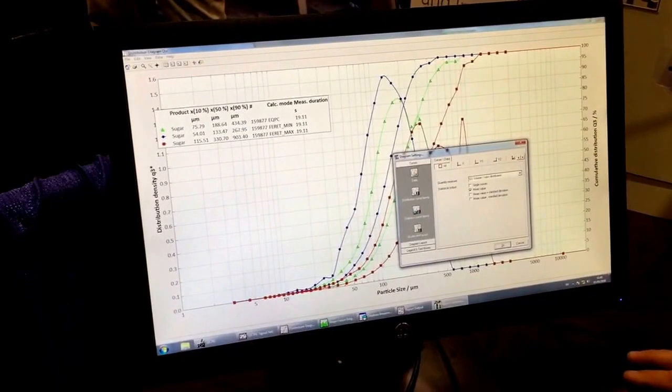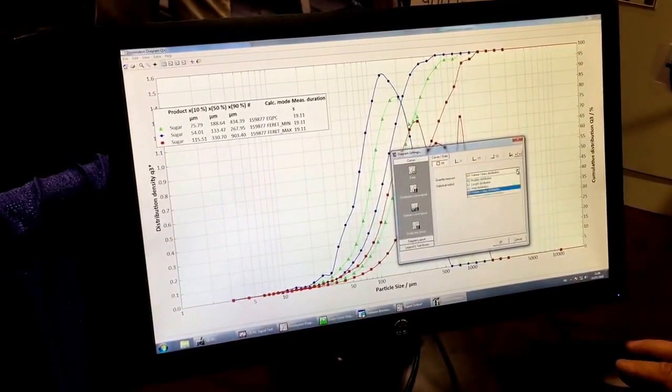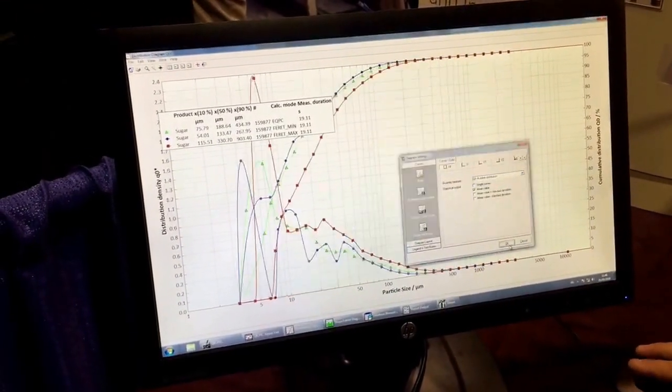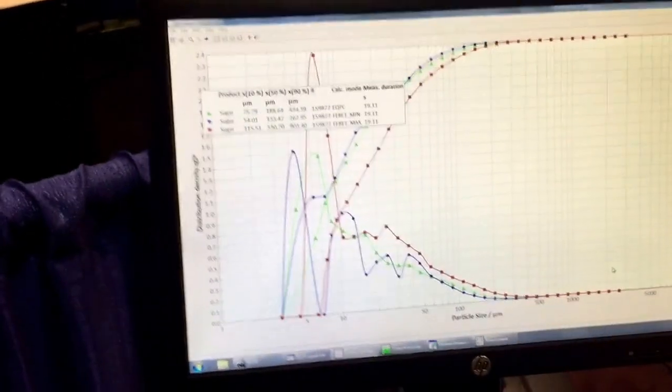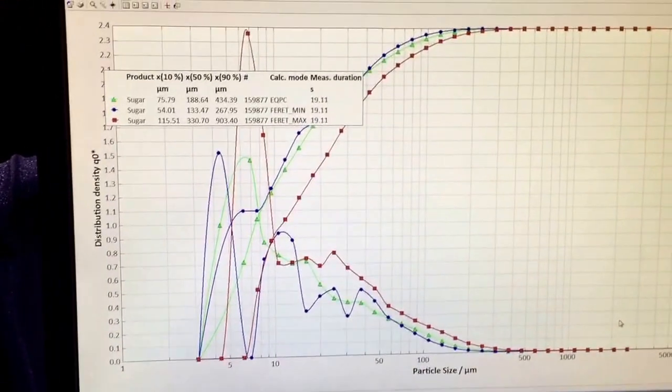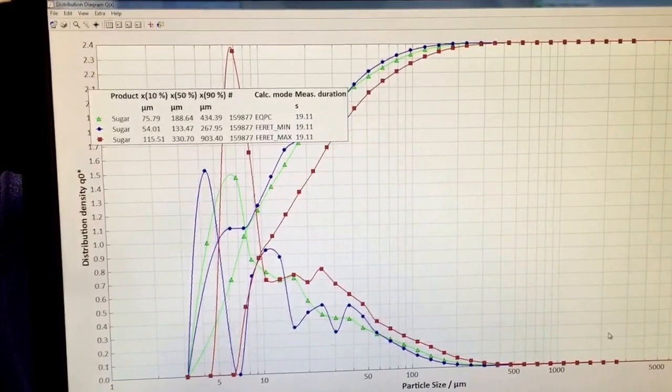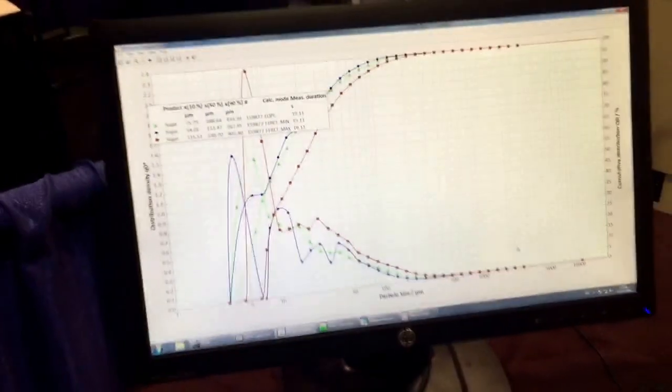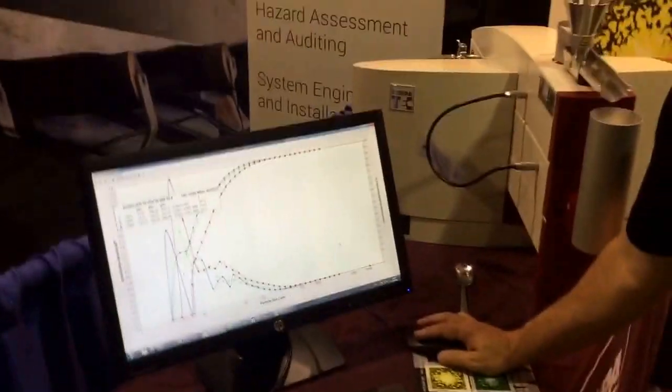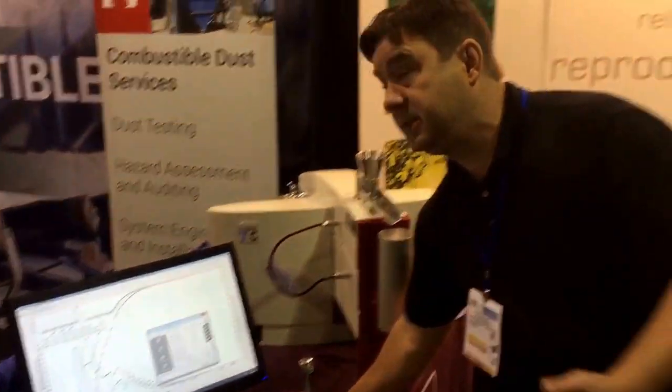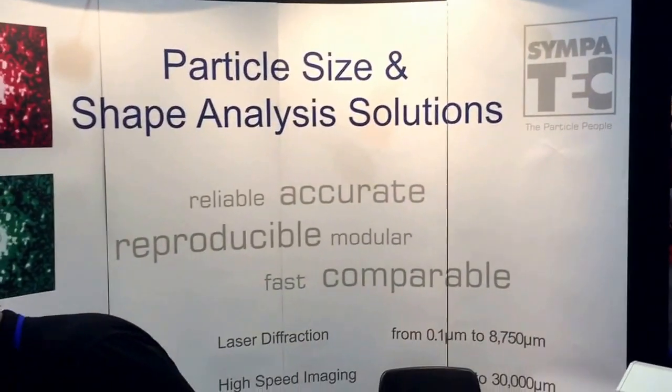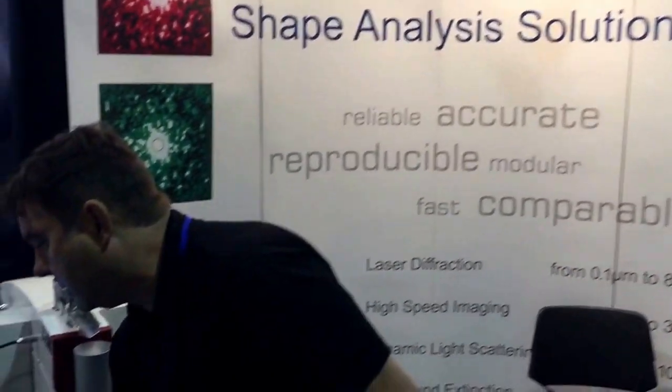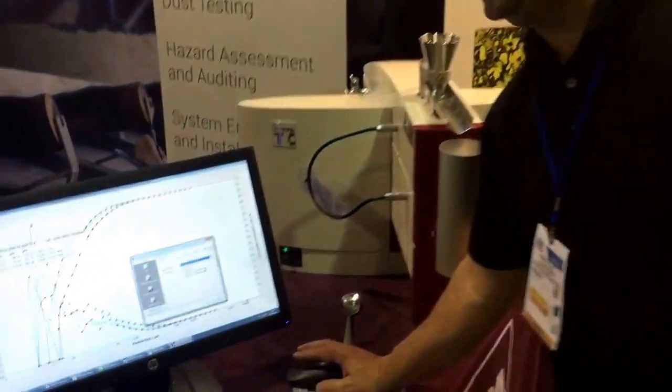To do a number distribution, so instead of volume I can go to number. Now you see by number it's quite different. But most particle sizing is done by volume, whether it's laser diffraction or sieving, it's all volume-related. But it's nice to know sometimes what your number distribution looks like as well.